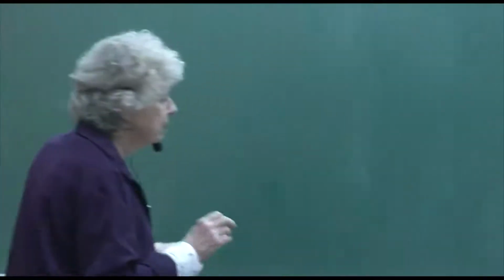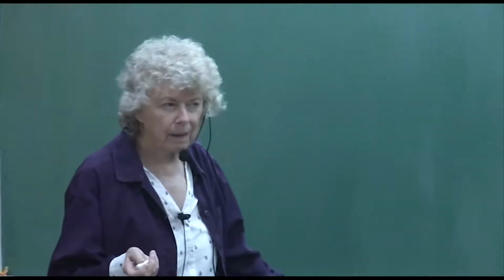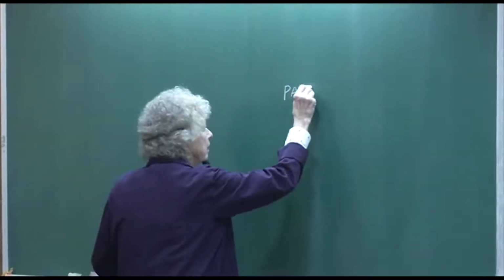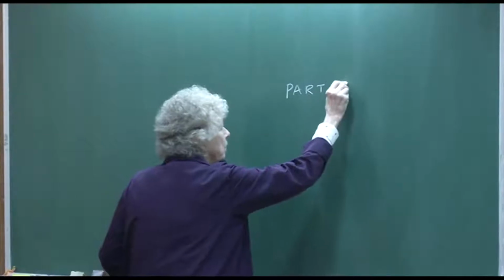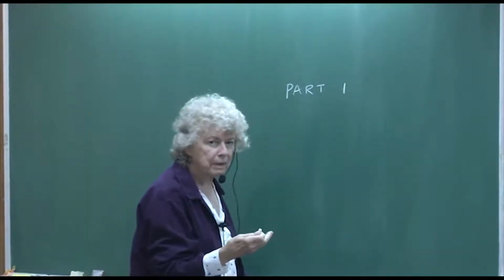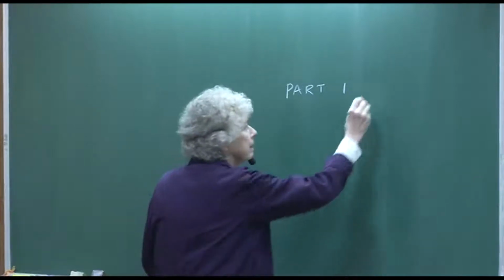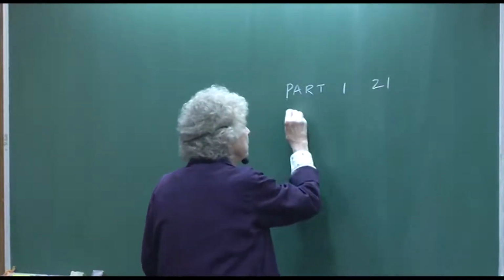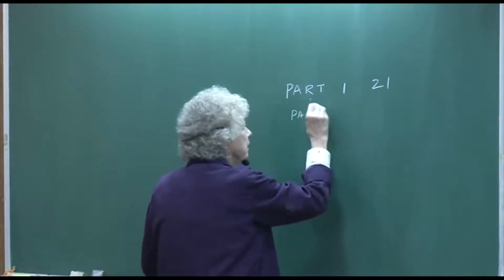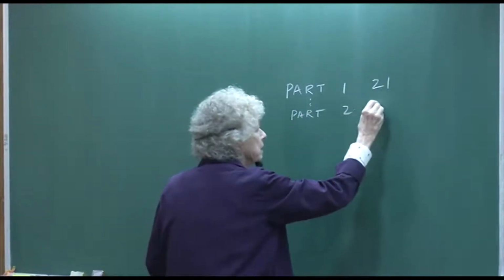unique. But if you are using a free variable, then they do have to be unique, because let's say you have something that's like part 1, and you assign a free variable to it so that it can refine the occupation of that part, 21, and then maybe part, then a bunch of stuff, and then part 2 minus 21.